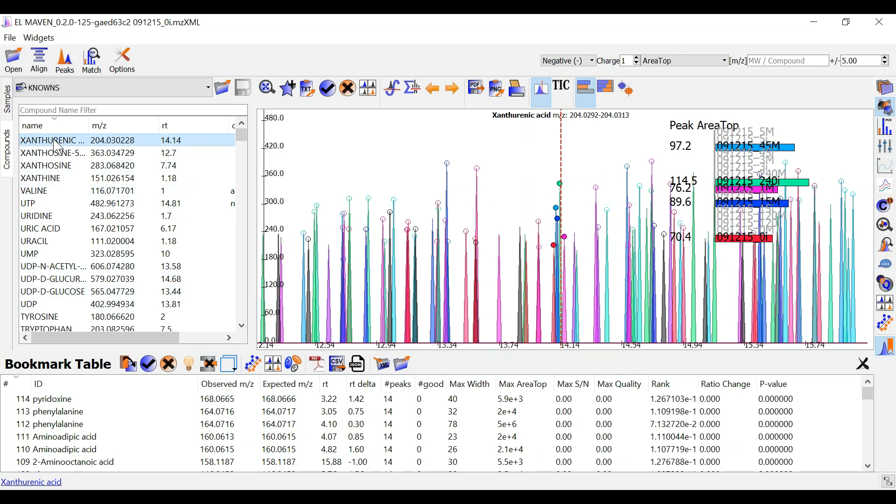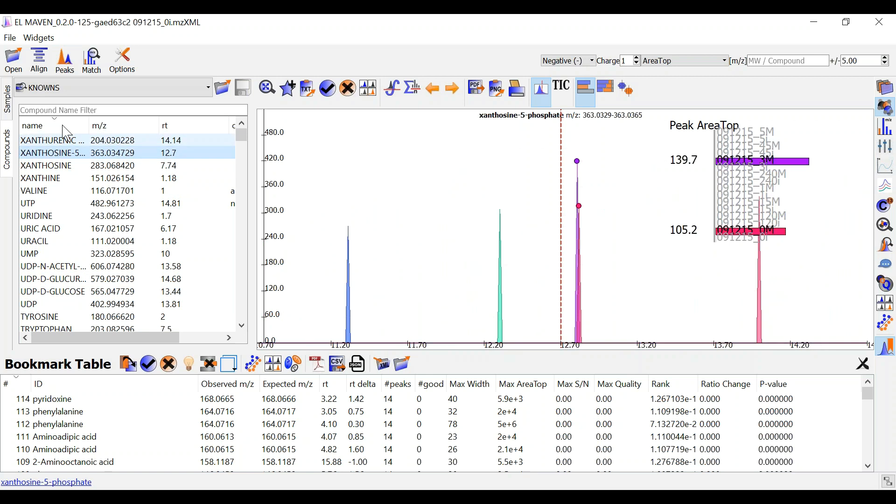When you click on a particular metabolite a good group for this peak will be shown. It may even display the group with highest intensity and good quality for a particular metabolite.